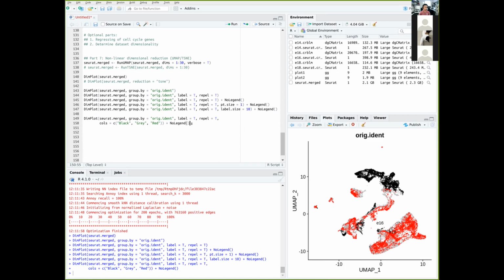So if you know some preset colors, for example, I think previously I've shown you this color palette from Color Brewer. They do have default palettes, and you just have to specify the name of the palette. You can do so. So I'm going to copy and paste the previous code, and instead of providing the 3 colors, remove the entire thing. So just cols equals to something, and type it in with open quotes with the commas. Let's try Set2.